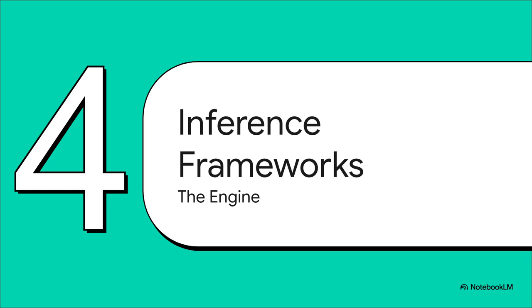All right, we've come a long way. Our data is prepped, it's all aligned. Now it's time for the main event, choosing the inference framework. This is the engine that's actually going to build our tree. This is the step where we feed our alignment into a complex statistical model and ask it to figure out the most likely evolutionary story.